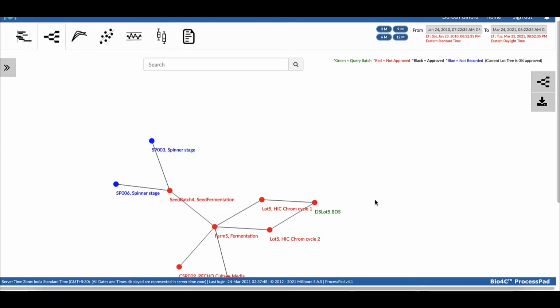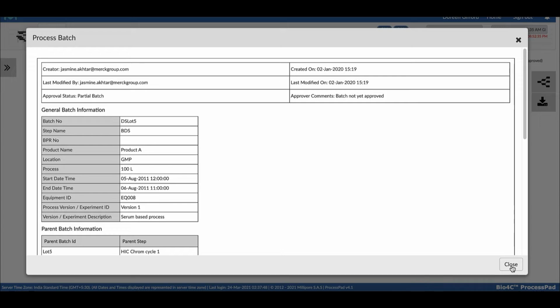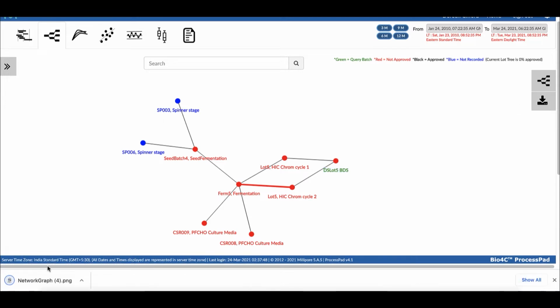Here we have Show Network, a great visualization tool which highlights the paths from one node to another. You can click on any of the nodes to see the ERecord. You can also click on a line between the nodes to turn it red. This visualization can spotlight a connection between two nodes, which can be helpful for an investigation. We can also download this visualization and add to a report.